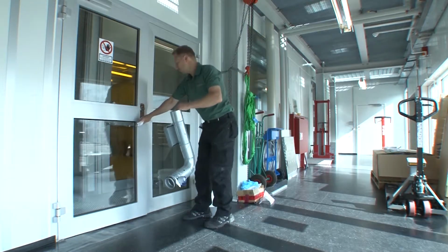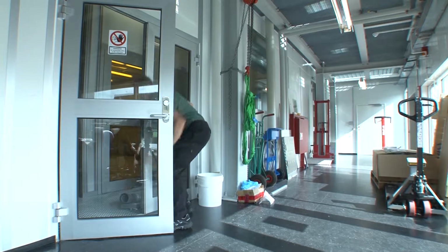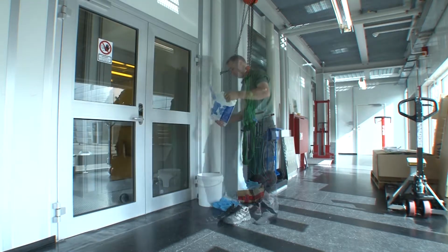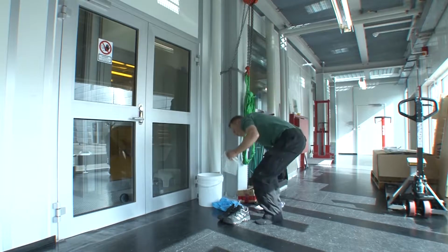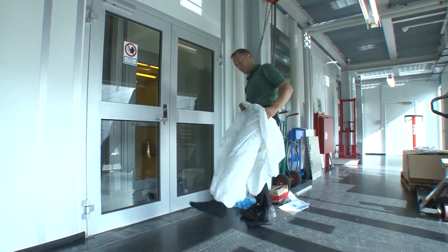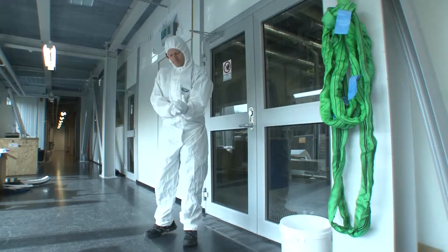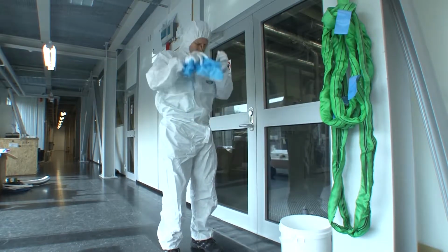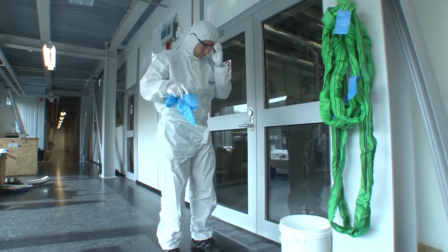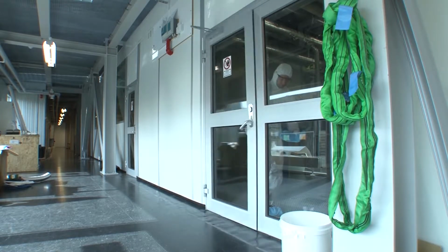If you only need to work in service rooms, then after special agreement, it's possible to enter through a service door. You will have to wear a special one-time use only suit. This is to prevent particle contamination from your own clothes. You also have to wear gloves, protective eyewear and shoe covers. These are all provided by Nanolab.